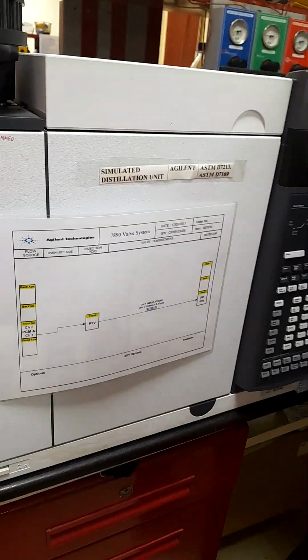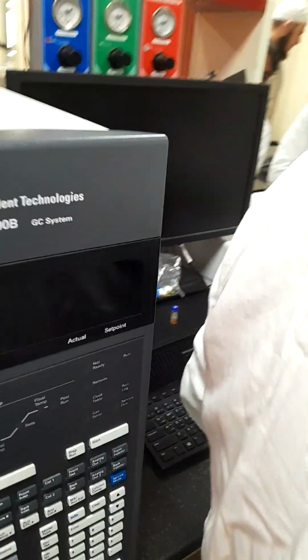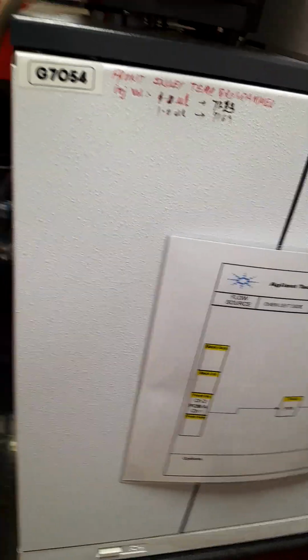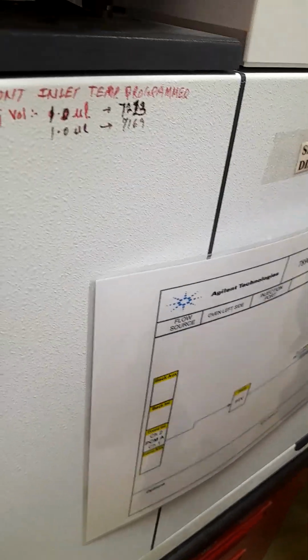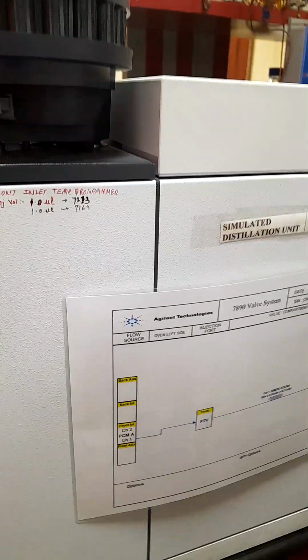Any type of sample. You have two phenomena: when the IBP remains below 615, and another one is 615 to 700 Celsius temperature. 100 to 615 is one ASTM application, known as D7213. We have two methods here, and we don't know the range of this sample. It's unknown to me. Which method will I apply first? I will apply D7213 only because it will cover 100 to 615.